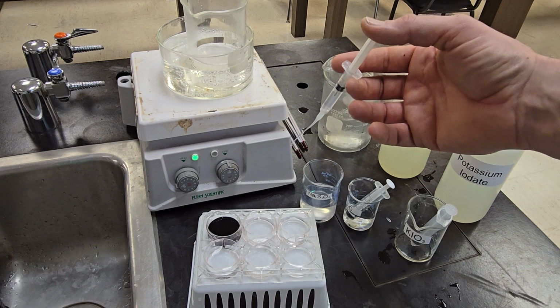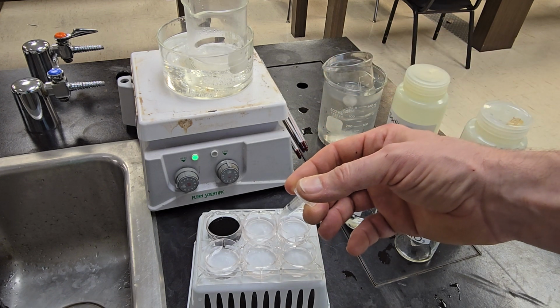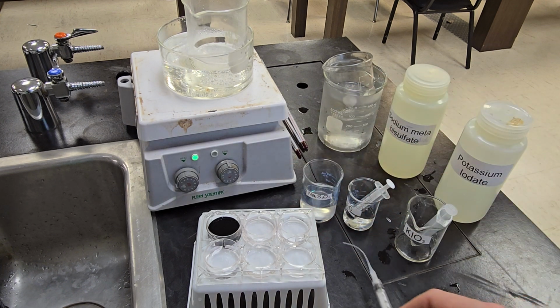Adding my sodium metabisulfate now. You should be watching the time at the bottom of the video.